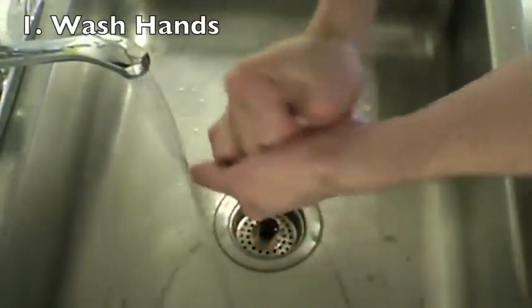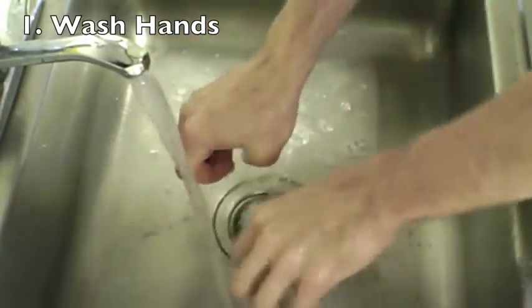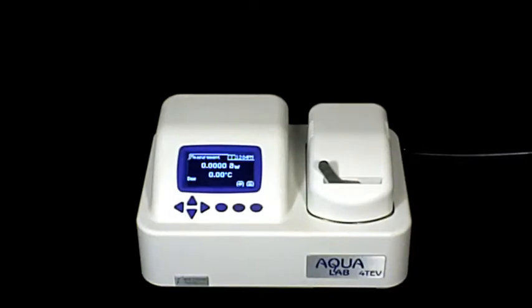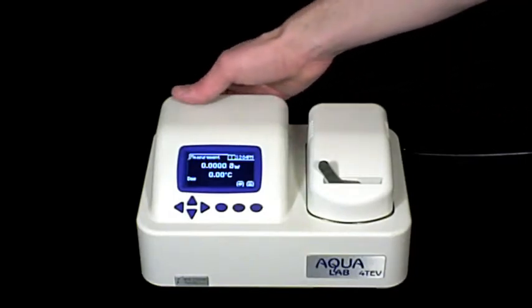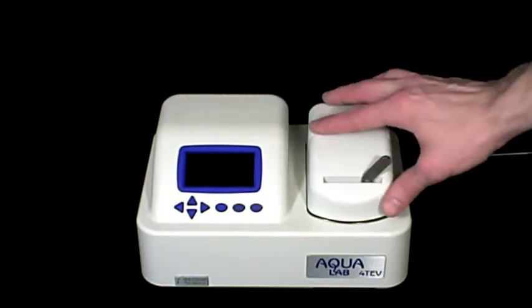Let's get started by washing our hands first. This ensures that oils that naturally occur on the hands do not interfere with the cleaning process. Once you have washed your hands, turn off the power to your Aqualab, and then open the lid to the sensor chamber.